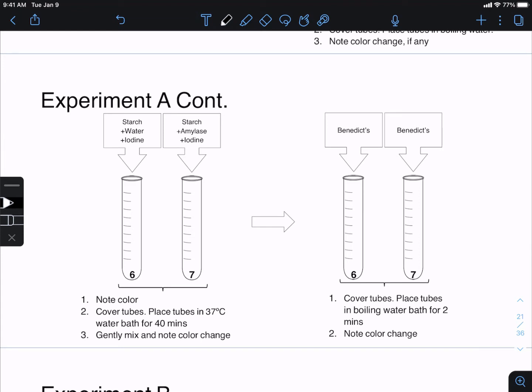You're going to look at the effects of amylase and how it affects starch, and what happens when you put amylase in a solution with starch. Now, you should already know what the chemical reaction is. I've already told you from your digestive enzymes lecture just a few minutes ago that amylase digests amylose, also known as starch, and produces from amylose monosaccharides, or sugars. You should know that.